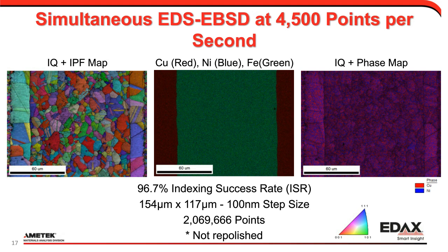There's a copper phase and then an iron nickel phase. They're both FCC, so when we try to differentiate those crystallographically, there's a loss of ability. They're not easy to differentiate because they both have the same interplanar angles. So our phase map there on the right is very speckled between the two, but obviously the chemistry is very distinct of where these phases are.